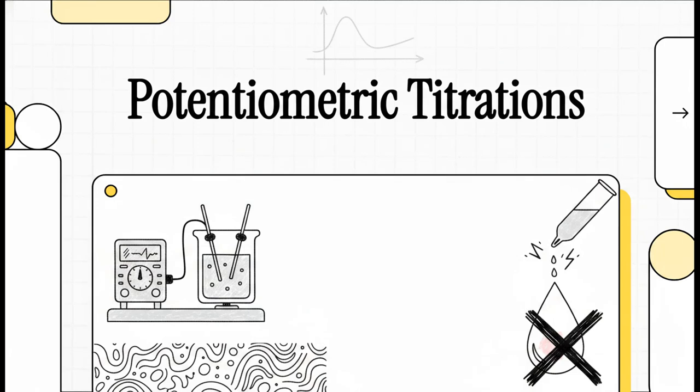Welcome to this explainer, where we're going to unpack Dr. Chem's really comprehensive lecture on the precision and power of potentiometric titrations. Listen, if you've ever spent hours in an analytical lab squinting at a burette, just praying to catch that exact drop where a faint pink color finally appears, yeah, you know the frustrations of classic titrometry. Well, today we're taking a massive leap forward.